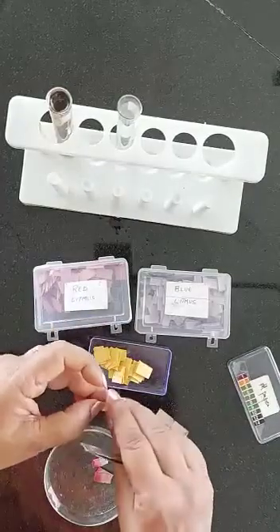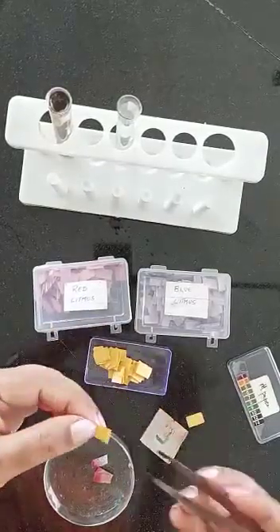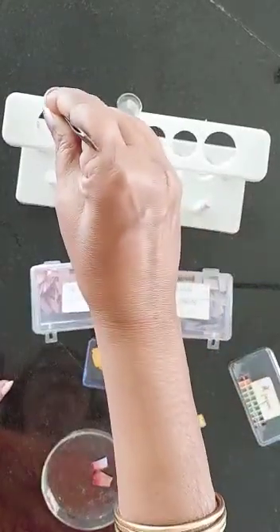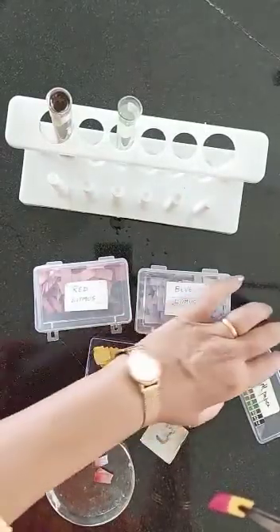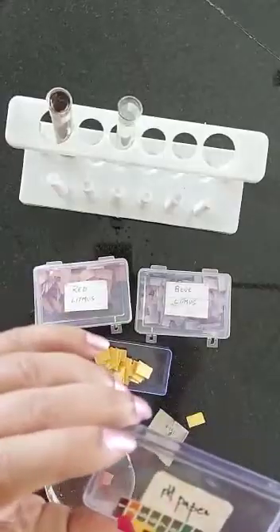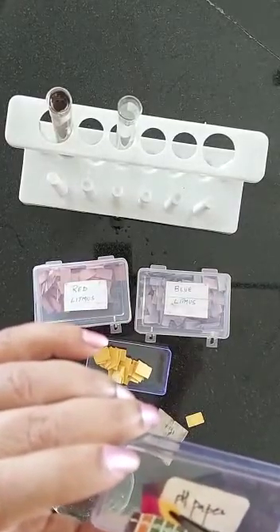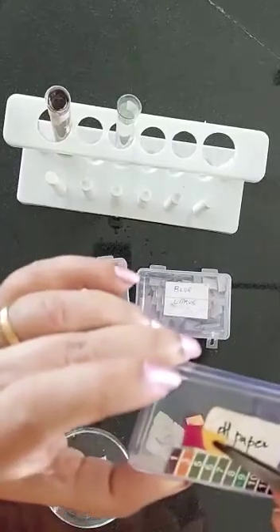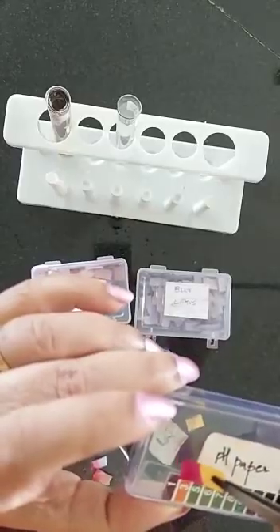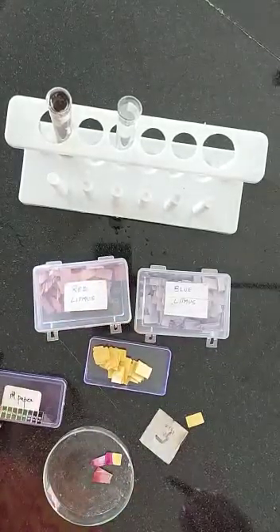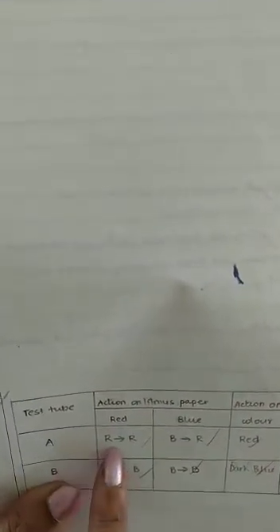Now pH paper has a scale — a pH scale. I take pH paper and dip it in the solution, and I can see the pH paper shows number 1. So we can easily say that this pH number is 1. I now write down what I see in my journal. Solution A: red litmus remained red, blue litmus turned red, the color of pH paper was red, and the pH number is 1. Hence the conclusion is solution A is acidic.